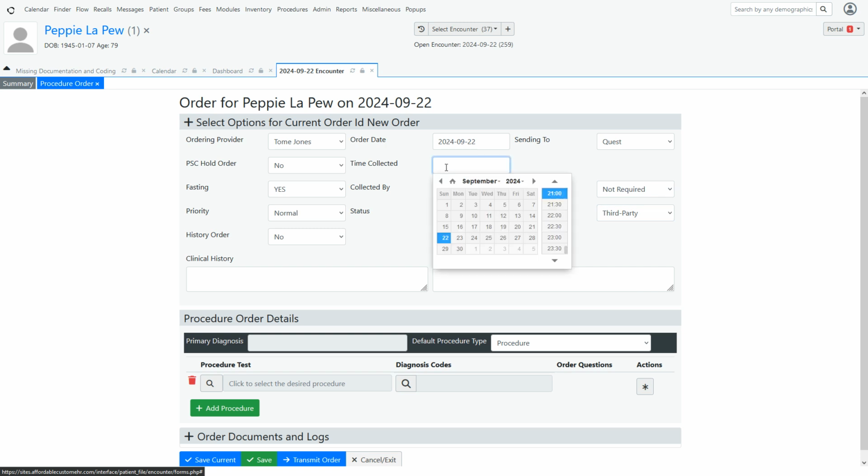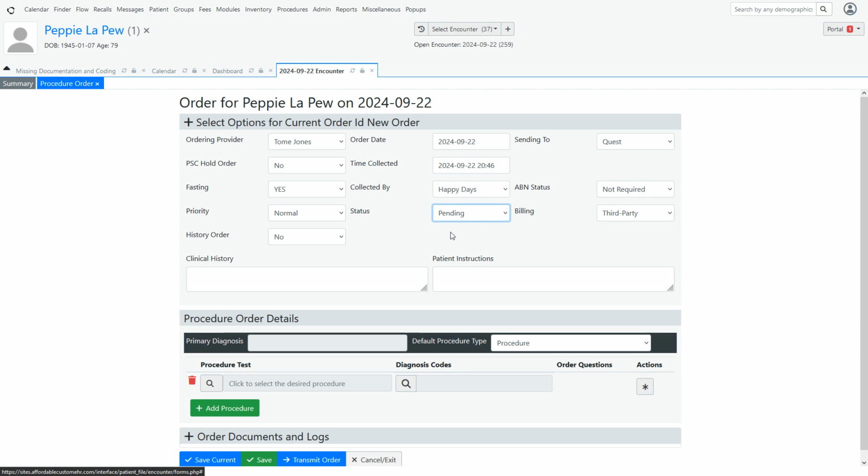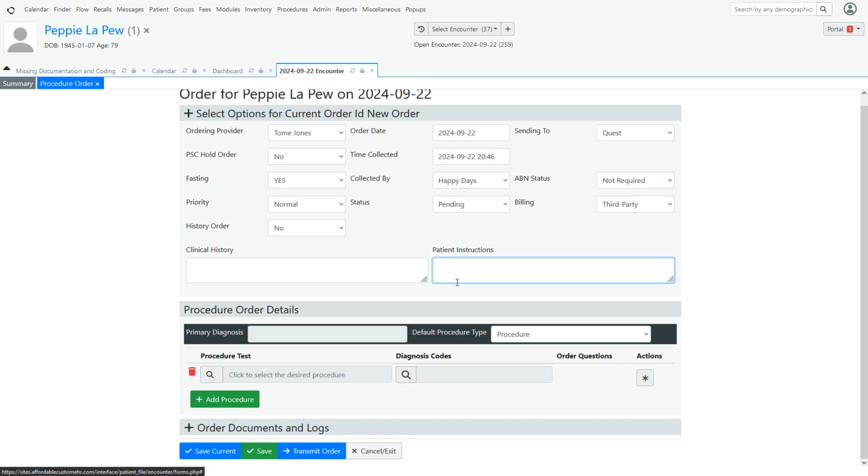And then you've got to put a collection date in there. Again, your order is not going to be right if there's no collection date. So you can see today is, okay, I'm going to go ahead and leave that there as my collection date. Now my top level is ready to go. Any patient history or patient instructions, those are self-explanatory. And now most labs require a diagnosis that goes with the lab. You can put that there.